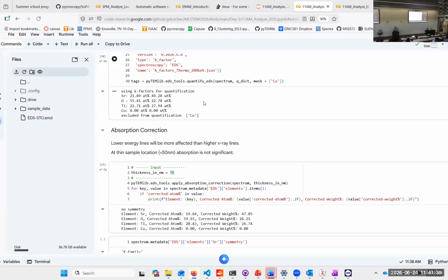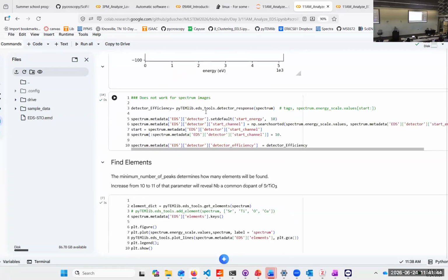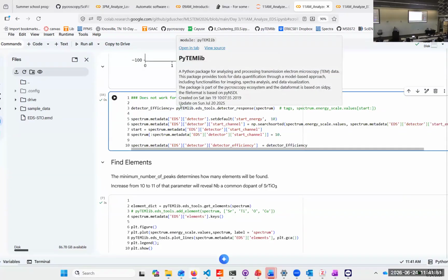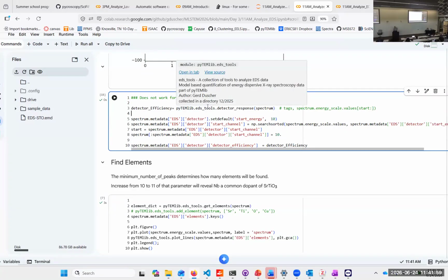Yeah, that is exactly the point I was making. So 0 up to 680. So if you run this code cell a second time, then it should work. Shantanu. I know it's a bug, and I didn't find the reason for it. Spent my whole breakfast with that, so it needs some illumination and more digging into that. Okay. Do we have any other problems? Any questions on that?